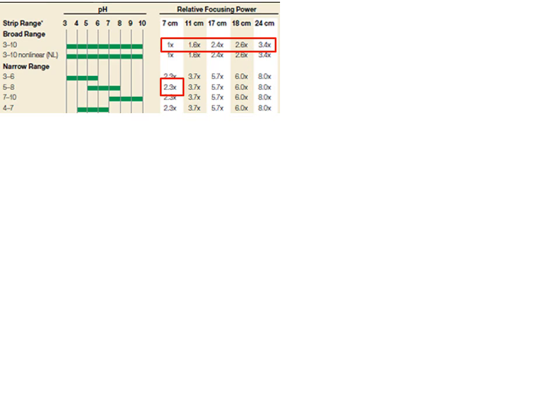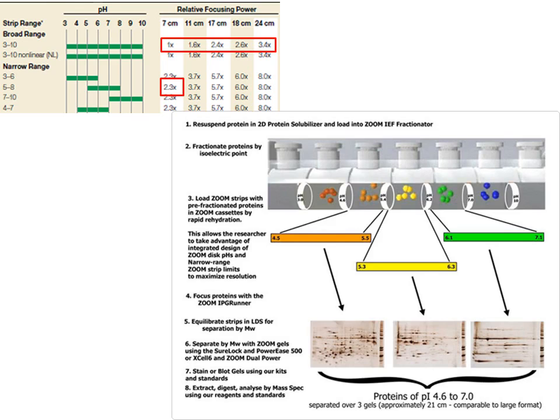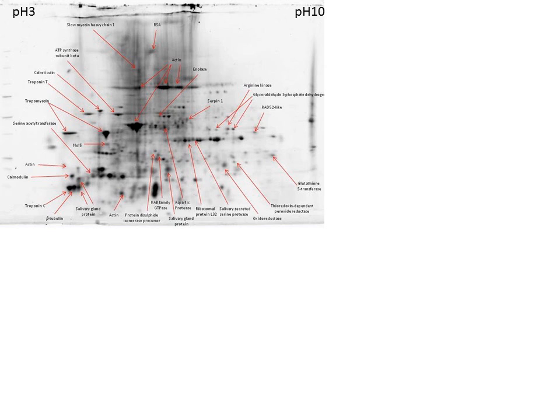This is most effective when performing a prefractionation by charge using carrier ampholyte IEF in a Rotofor or a multi-compartment electrolyzer. In this case, the proteins are focused into chambers of a narrow pH range, the contents of which are then loaded onto narrow range IPGs for further focusing and then SDS-PAGE. The result of this is the practical example used in a previous lecture.